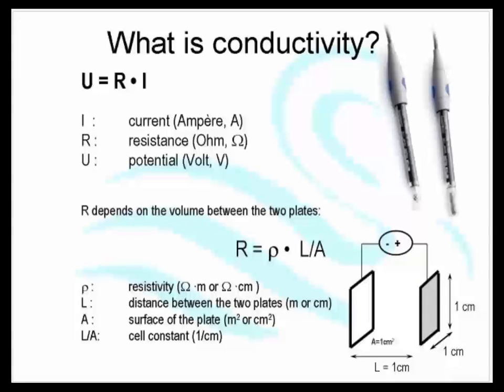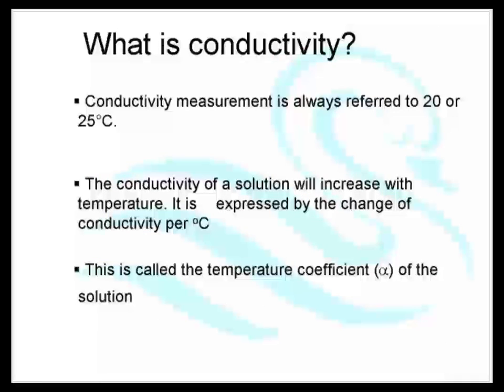Conductivity probes look like this. The temperature of the liquid is going to make a big difference, so we also need to measure the temperature and compensate for the temperature.